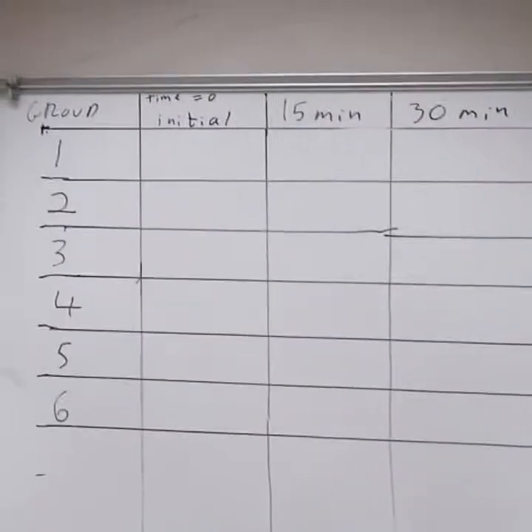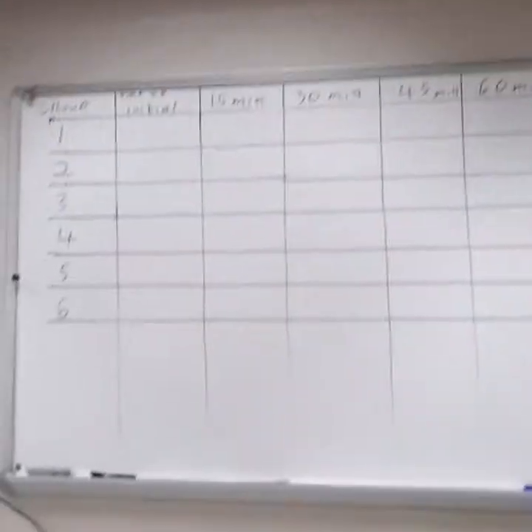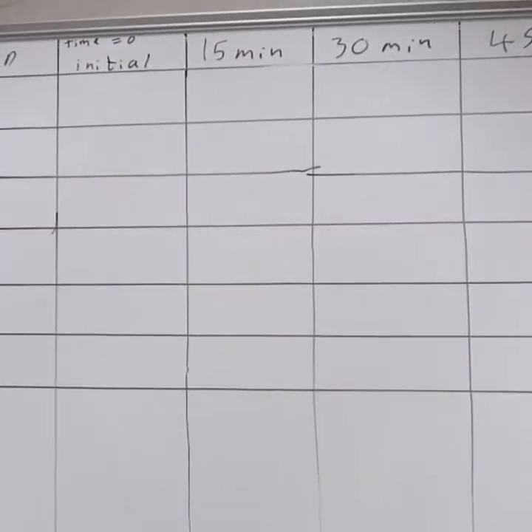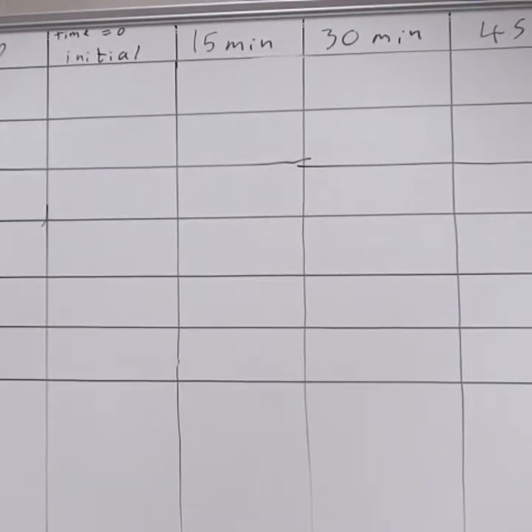I'll put it up here on the board and see what you have up here. That's flask 1, 2, 3, 4, 5, 6. These three here are at room temp. These three here are at 35. And then that's 0 grams of sugar, 10 and 40, 0, 10, 40. So you can get what's in these flasks right off the data sheet.